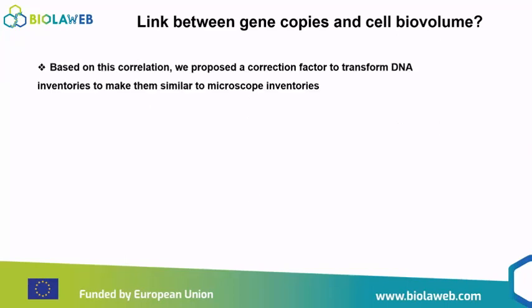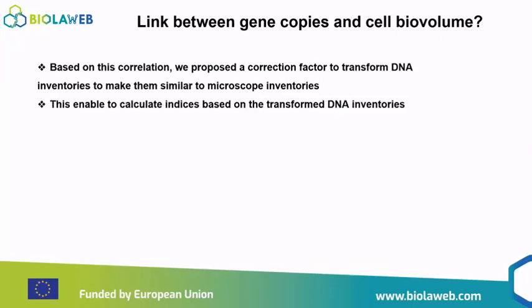Based on this correlation, we can make a correction factor to transform DNA inventories to make them more similar to microscope inventories. This enables us to calculate diatom indices based on these transformed DNA inventories.